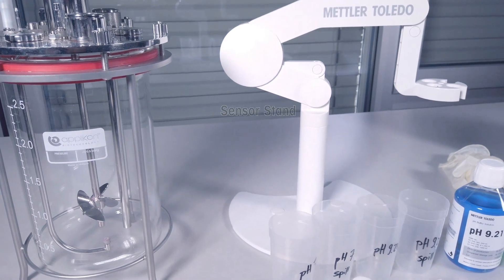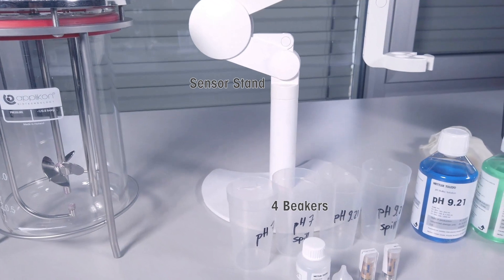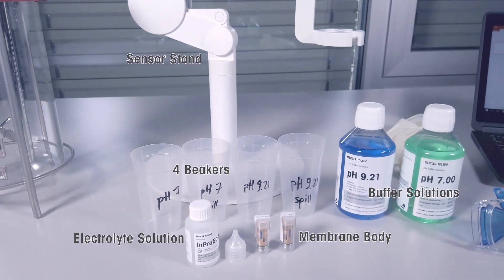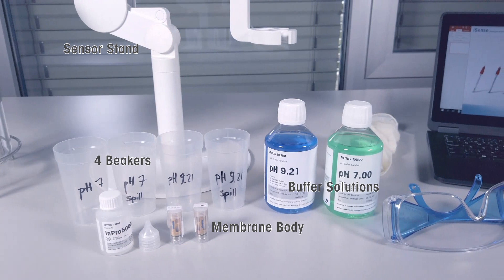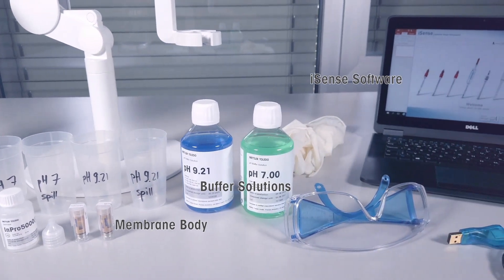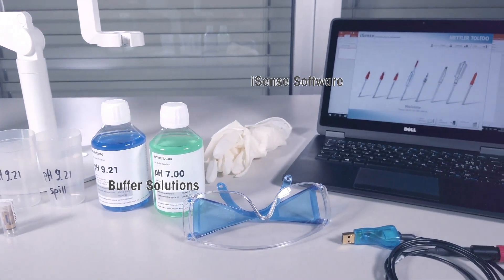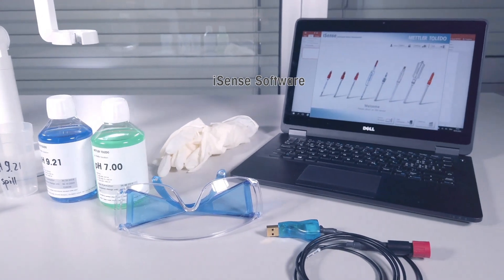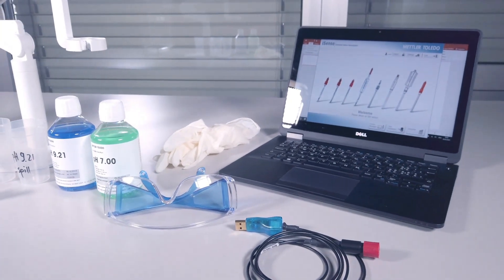To perform maintenance and calibration you will need the following: the supplied electrolyte solution, a new membrane body, Mettler Toledo pH Buffer 7 and 9.21, at least 4 clean beakers, a sensor stand, and Mettler Toledo iSense software or transmitter. In this video we will be using iSense.